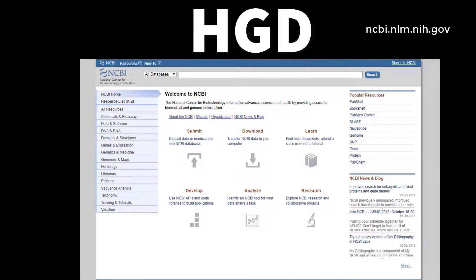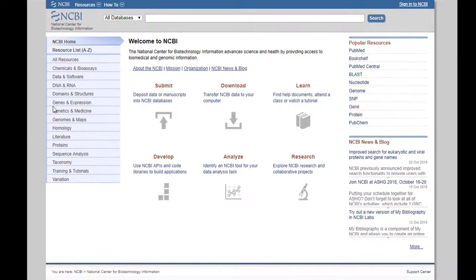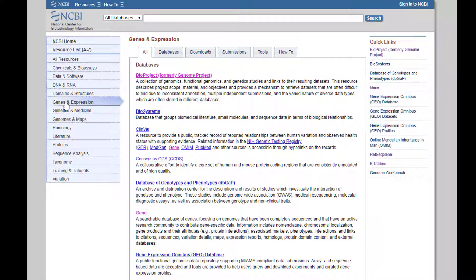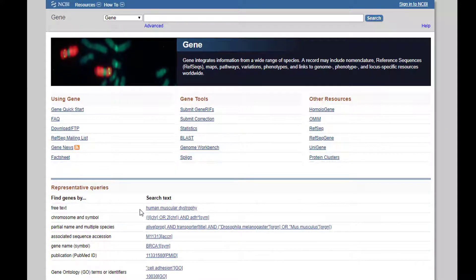Now I'm going to start showing us how to find the gene sequence, starting by navigating to the NCBI website. On the left-hand side, through their links, the Genes and Expression link is what we're looking for — go ahead and click on that. Then go over to the Gene link to search the gene database on NCBI. When we're on the Gene link, we'll type HGD right into the top search bar, and after we hit Search it'll give us all the genes linked to the letters HGD.